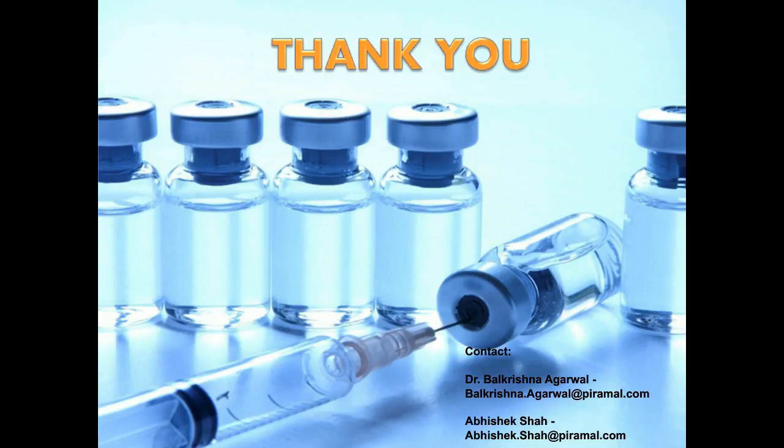No, it is not required to quantify all the extractables, because we have the AET limit, below which there is no requirement. You can just identify the component and report that identification. So all the extractables do not need to be quantified.